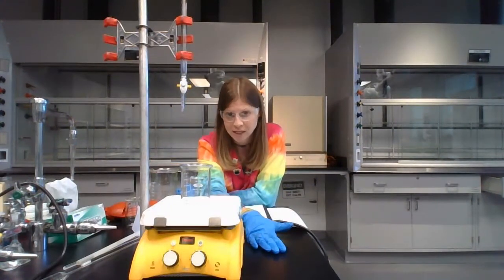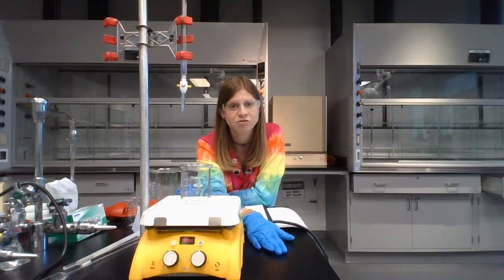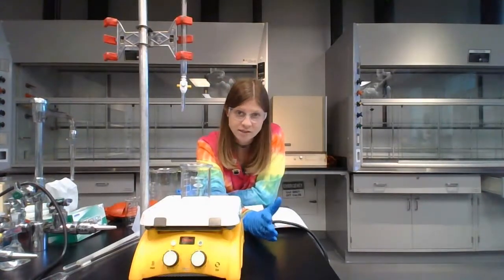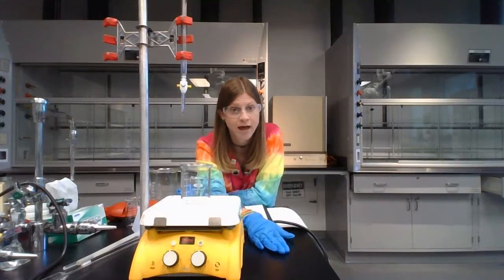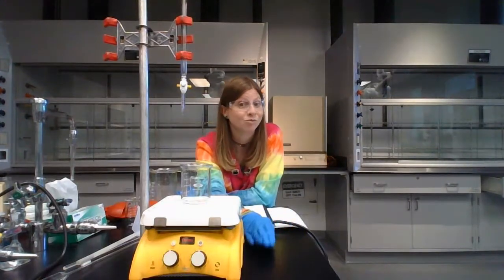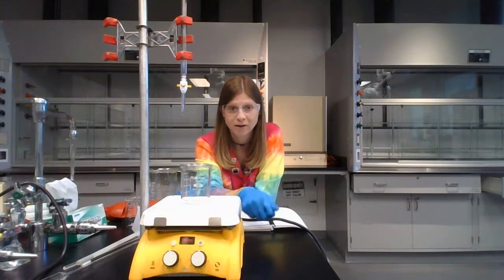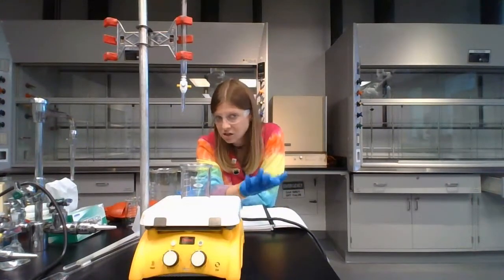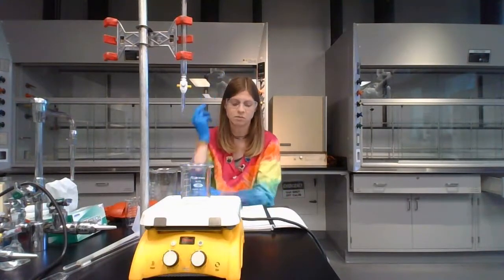Spilled potassium permanganate got on their cell phone. Because of the hazards with potassium permanganate, that cell phone became chemical waste, got put in the waste container and was picked up. The student lost their cell phone because they had it out and it got a carcinogen, something that causes cancer, on it, and we could not let the student leave the room with that. So bring your lab manual, pencil, and calculator with you when this happens, so that nothing hazardous gets spilled.